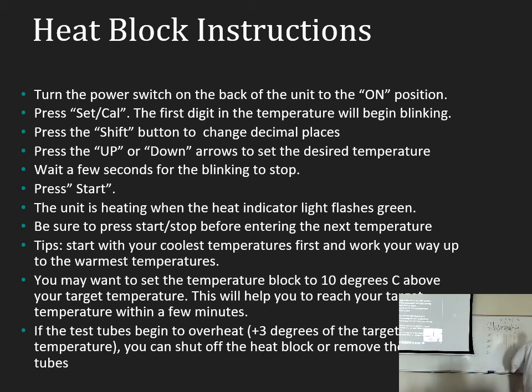But your basic hypothesis for today is going to be temperature and then catalase activity. So, is it going to speed up as it heats up? Is it going to speed up and then plateau? Is it going to speed up, plateau, and then crash? What do you think is going to happen? That's what you'll want to think about when you're predicting.